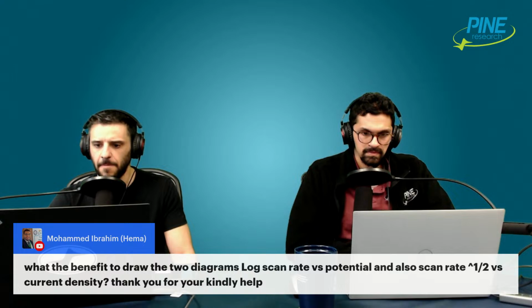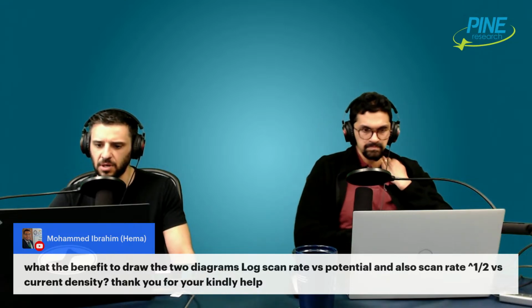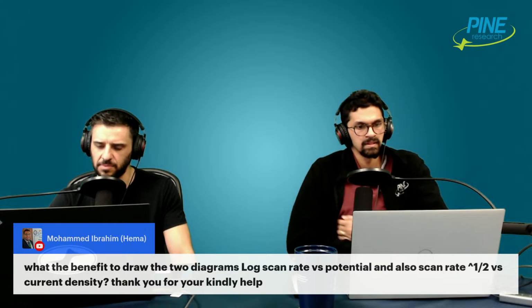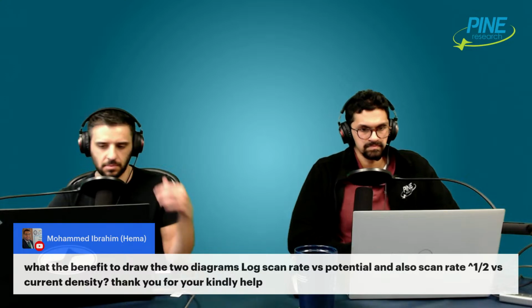But from an analysis perspective, I don't know where a plot is made that way. I'm not sure I know log of scan rate versus potential. I don't know what signal that is from. But the second one is pretty common.